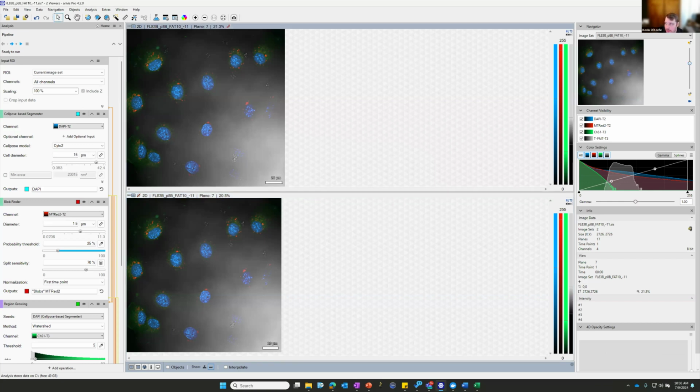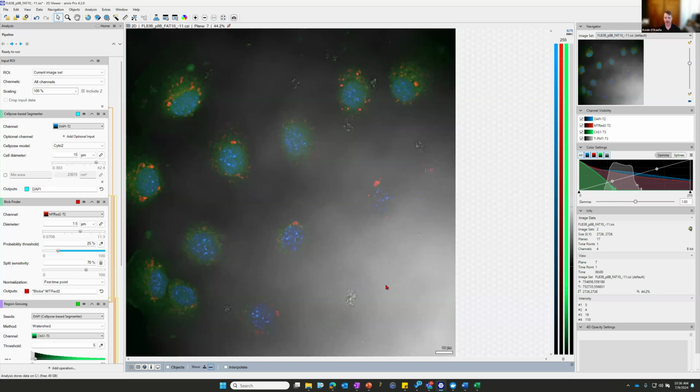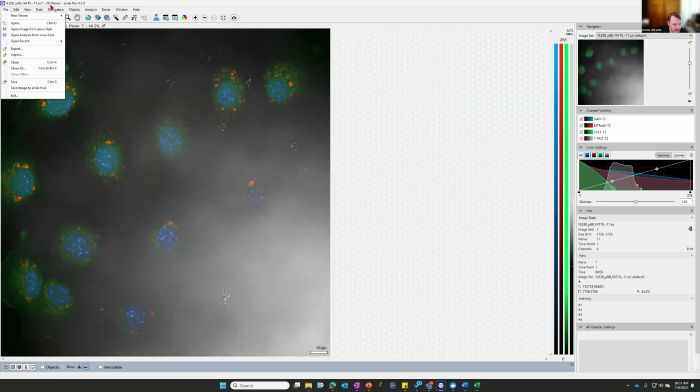Okay. I'm going to go back to a single view, go back to this default data set here. And I think that covers a basic overview of tools and buttons that we can click. Okay. All right. So now we have our image loaded, and we want to do some image analysis. Actually, before I do that, I'll go over these buttons up here, toolbars.